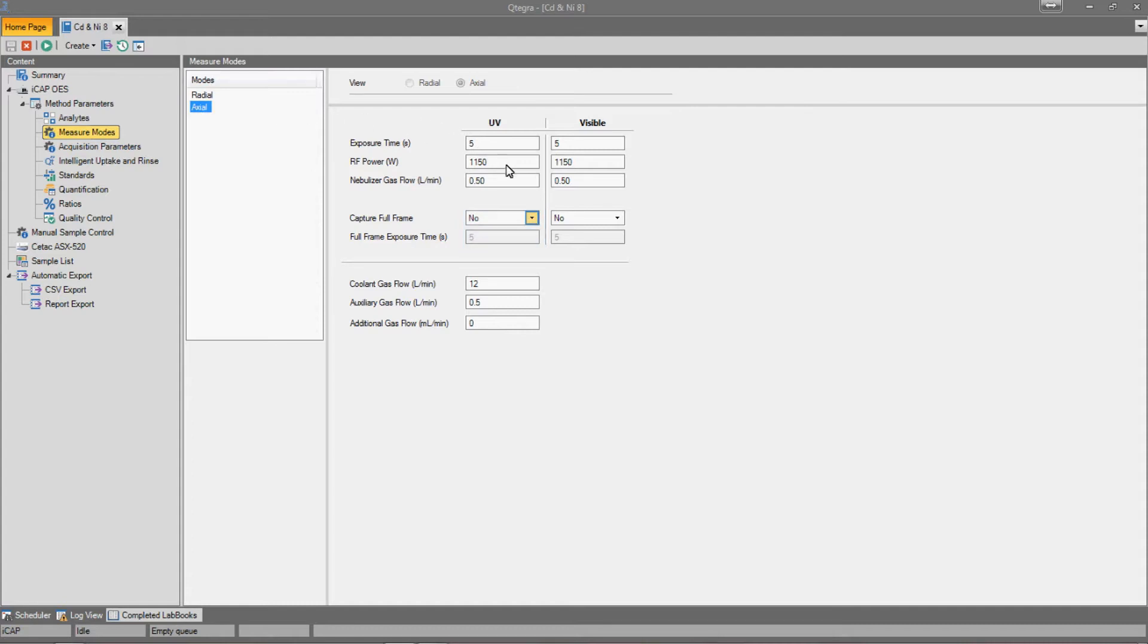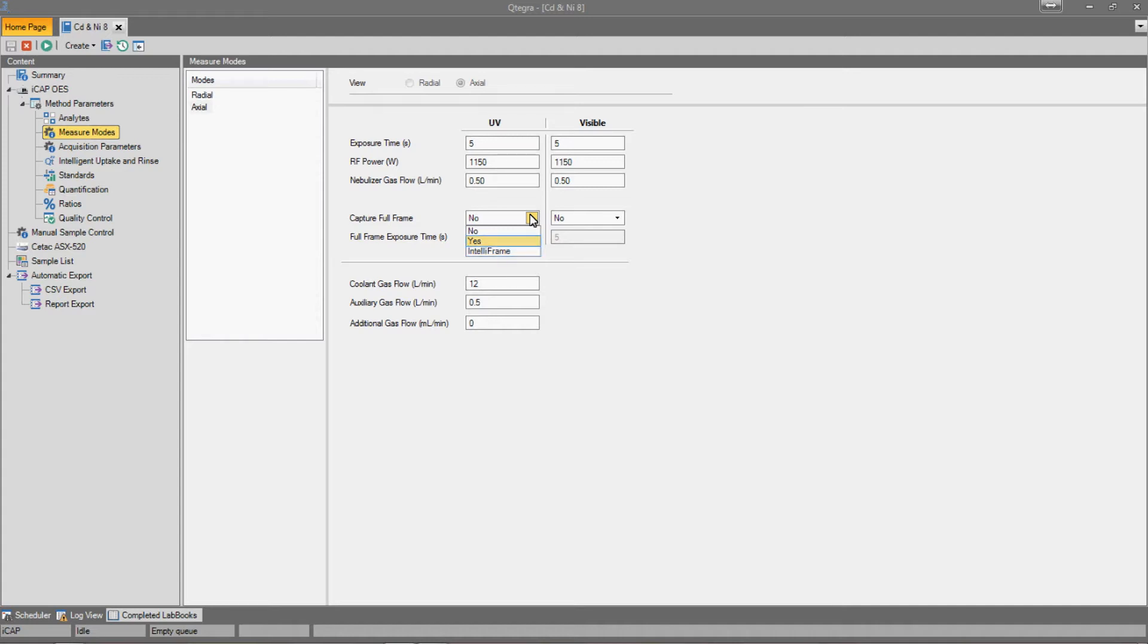We can change this by using the drop-down menu. Here, we are given two options. IntelliFrame intelligently selects the integration time for each wavelength dependent on its intensity, with more intense wavelengths giving shorter integration times. This is good for interference definition, but doesn't give a representative image of the sample.